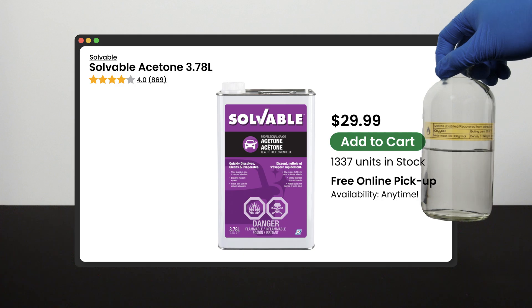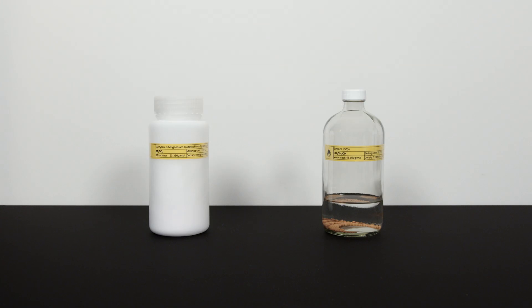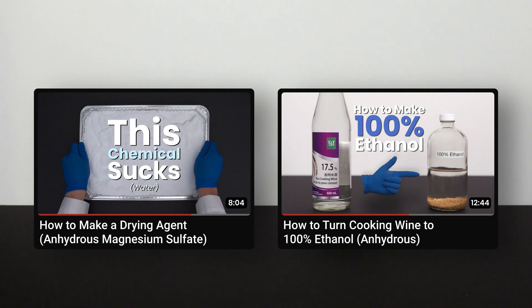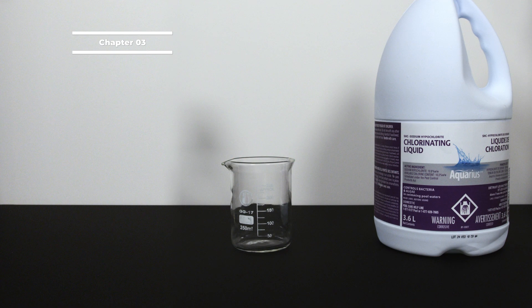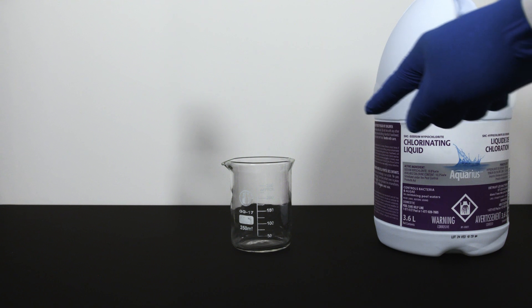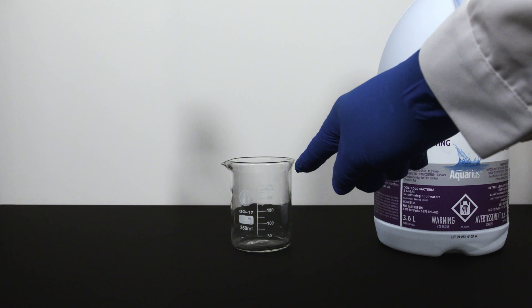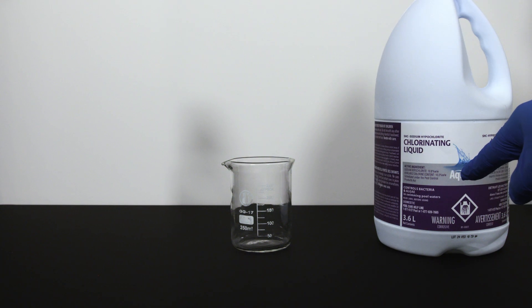I already have acetone in stock so I don't need another can. In addition to the main ingredients, you will also want two supplementary chemicals: a drying agent and a stabilizer, which I already made in previous videos. You can unlock your tech tree by watching those two videos. For the experiment setup, you can use the original bleach container as the reaction vessel by pouring out about 150 ml of bleach solution, making room for the addition of acetone.